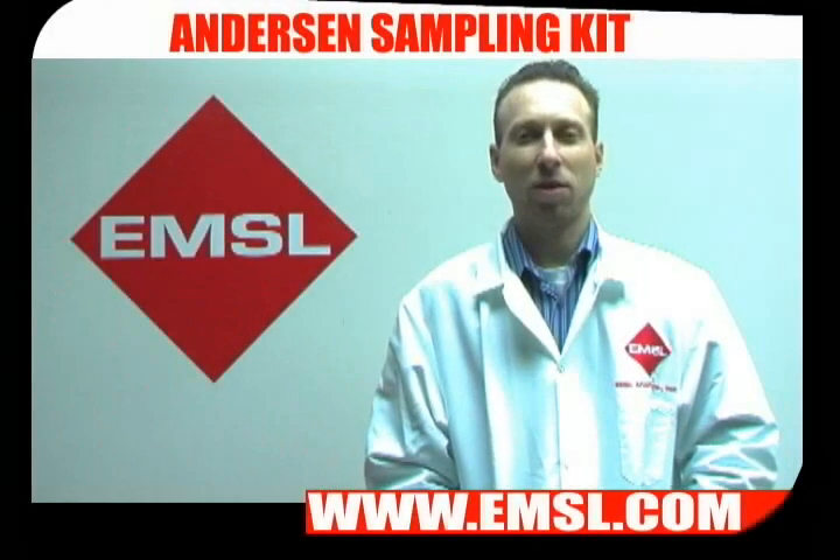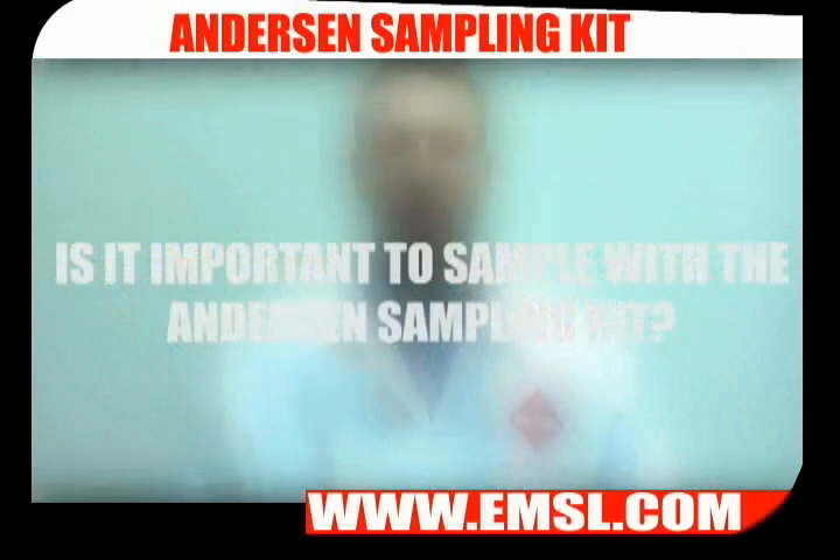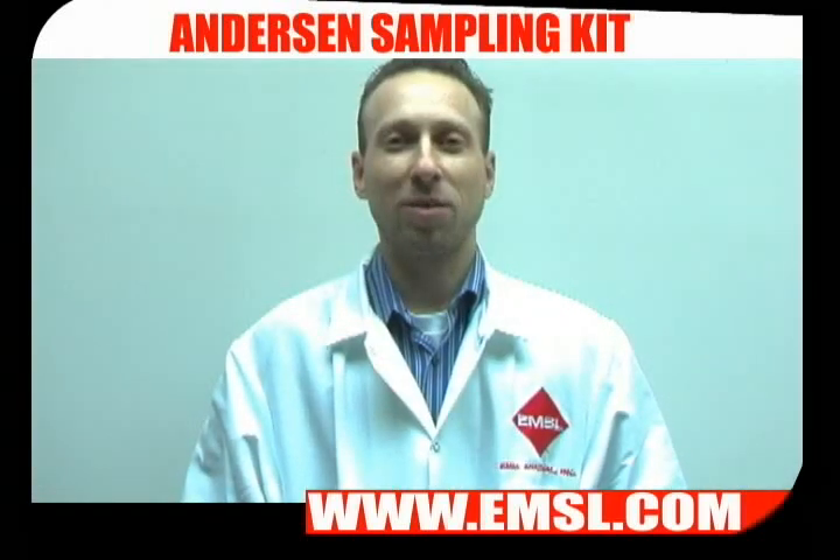Welcome to EMSL TV. Today I'm going to show you how to take an Anderson sample for bacteria or fungi. Anderson sampling is important if you think you have an indoor air quality problem in your facility, either for mold or for bacteria.